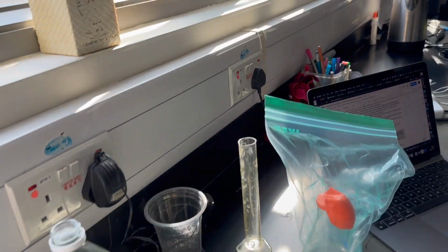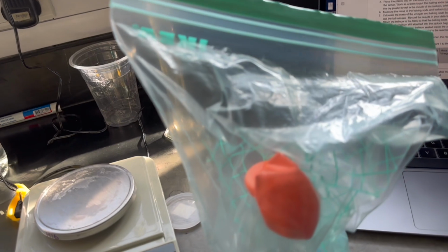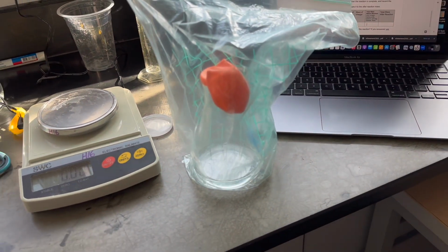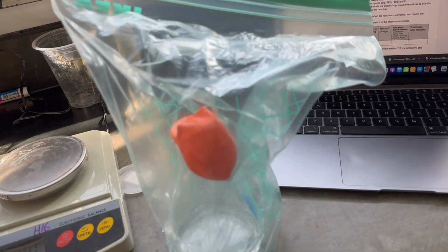Okay. So we've got things ready, all sealed up. So now when the reaction runs, the gas should be contained by the balloon, and any gas that might escape from the balloon can be contained by the bag.